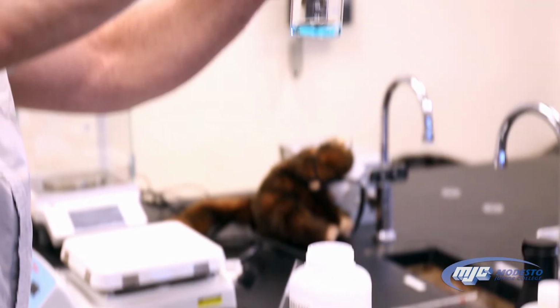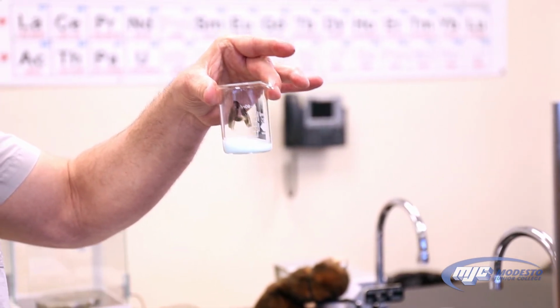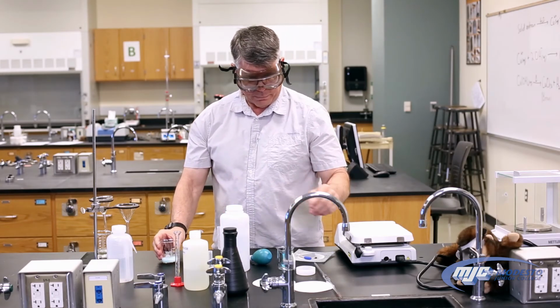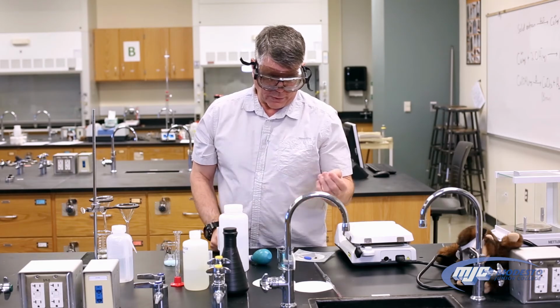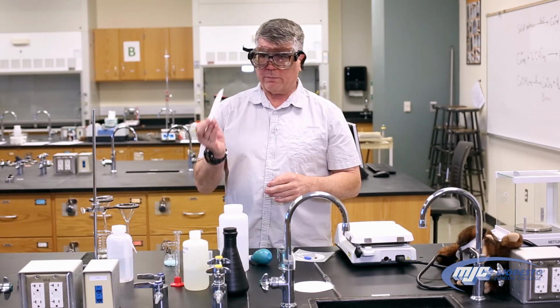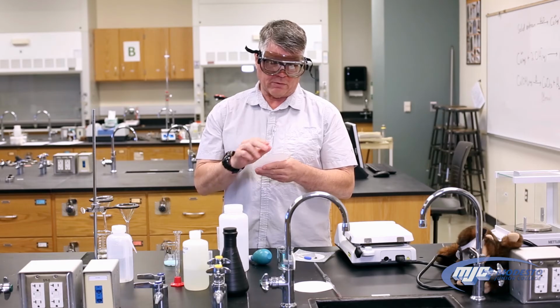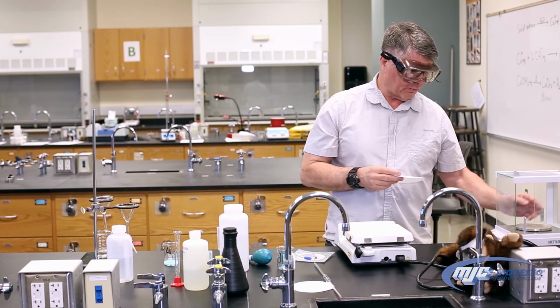And when you add it, see that white? That is lead 2 sulfate. It's already formed, completely precipitated. So now we're going to take another piece of filter paper that I've labeled with my name, and this one says lead 2 sulfate on it. I'm going to weigh it, so make sure the balance says zero.